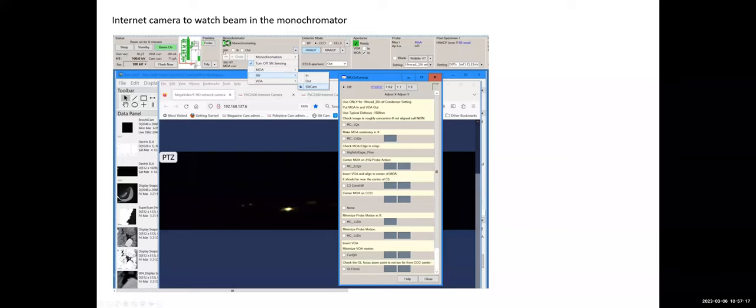So in the slit motor drive, there are actually three positions. You can put monochromator slit in, you can put monochromator slit out. You can also choose a slit camera. It will help you to find out the beam. So normally after the voltage change, this beam will be lost. So I normally put in this slit camera in and use this MC11 QX module to find the beam. You don't need to do this part. It's a lower level alignment, but it's something I always do when I do voltage change.